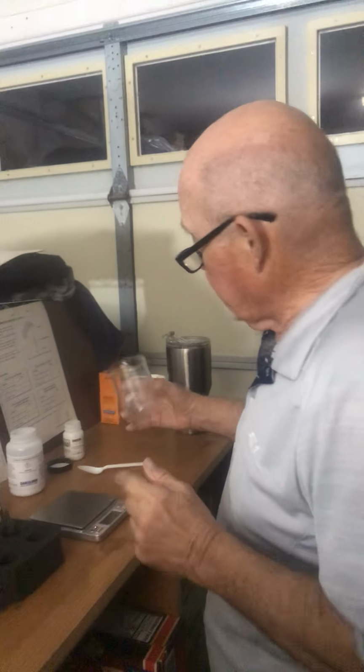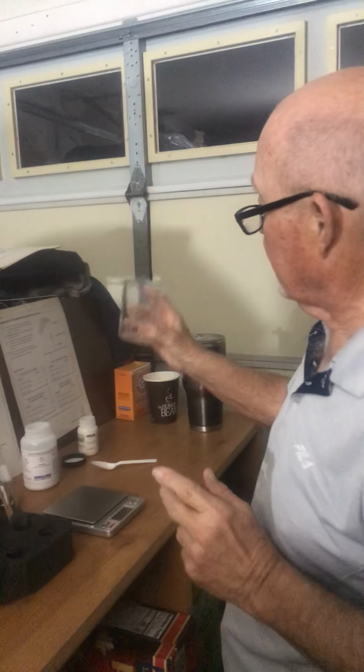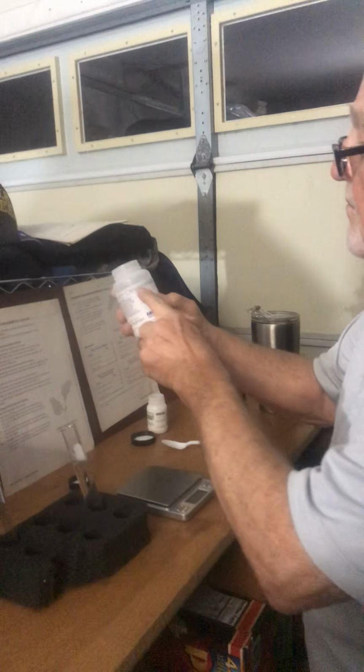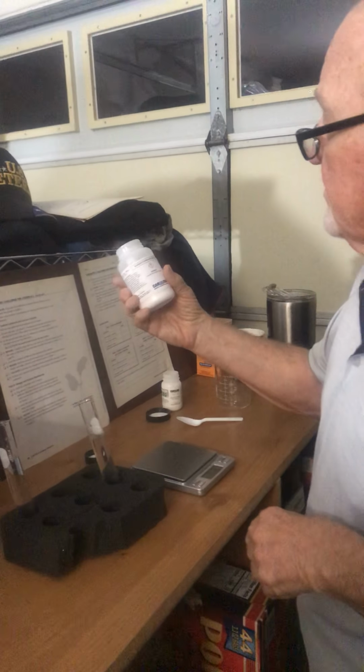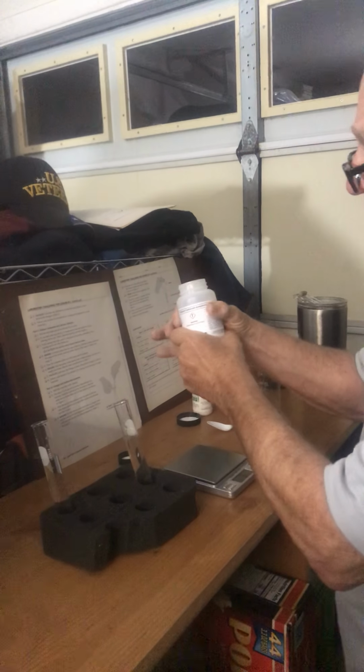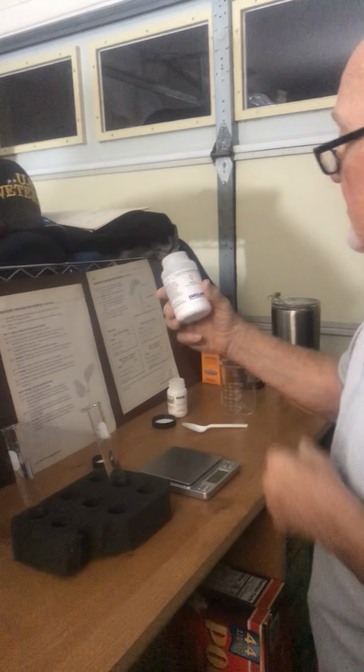Okay, so what we have is a 200 milliliter beaker, and we have some salts, some sodium carbonate, which is a form of a salt. It comes as ash when plants burn, and it's also used as an ingredient in making glass and some other things. It's a very useful tool in the manufacture of a lot of items.